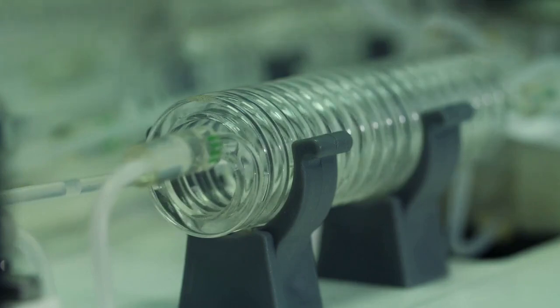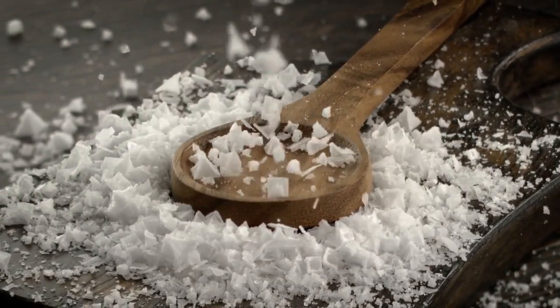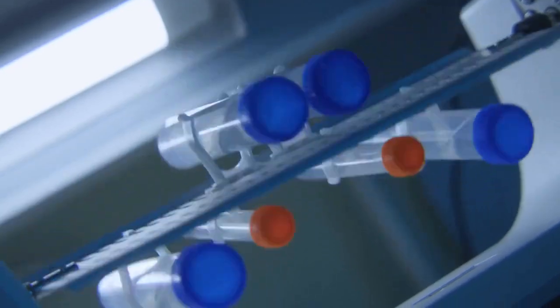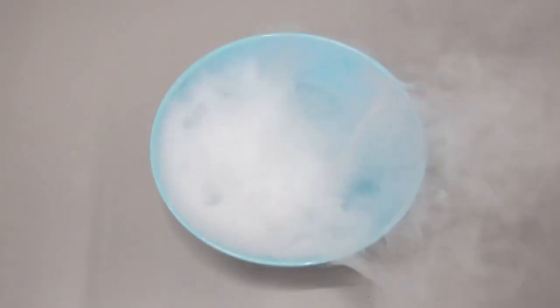Our third major difference is how they handle samples, especially water. Water is a huge problem for FTIR because it absorbs infrared light very strongly, which can completely overwhelm the signal from your sample. This means samples for FTIR often need to be completely dry.